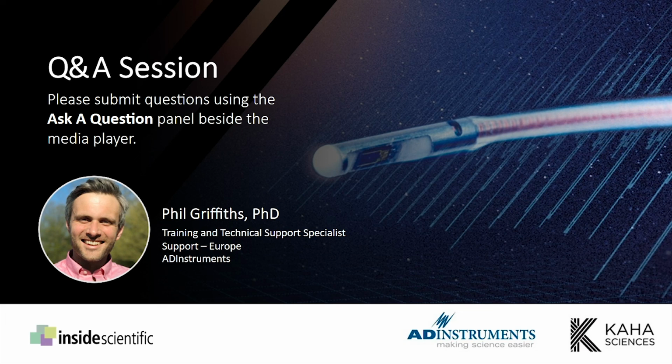Okay, I'm not aware that anybody's measured CSF pressure in the spinal cord. It's possible. It just depends on the size of the sensor relative to the space that you can put it in without causing too much damage to the spinal cord, I think.